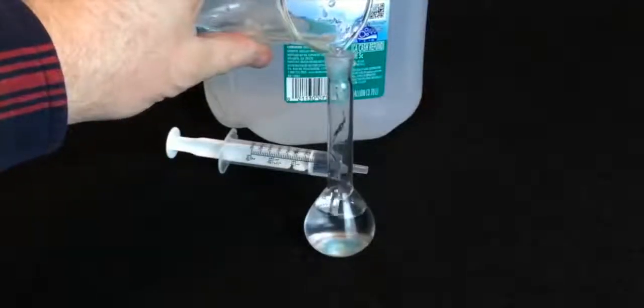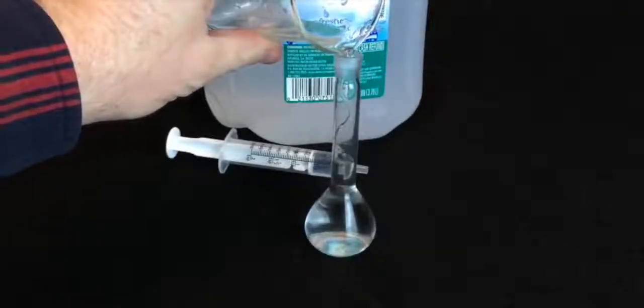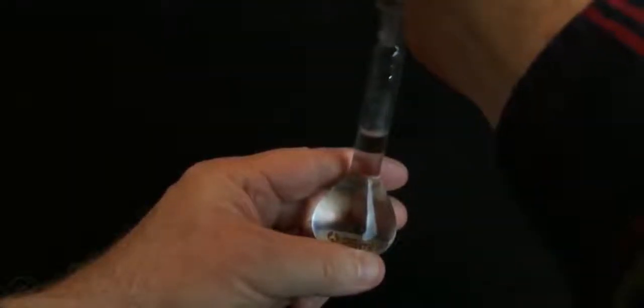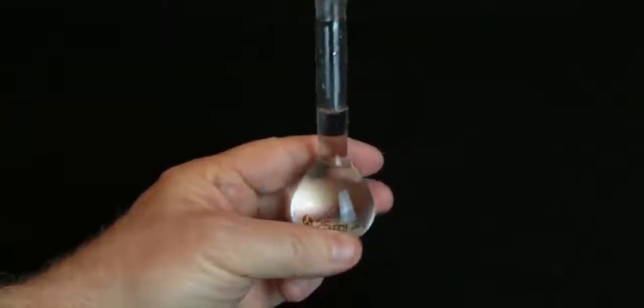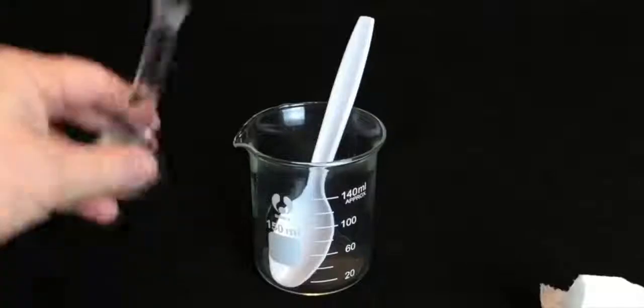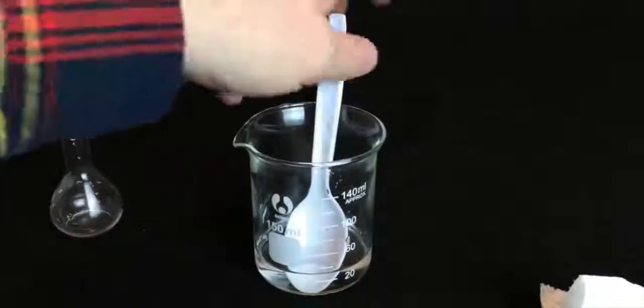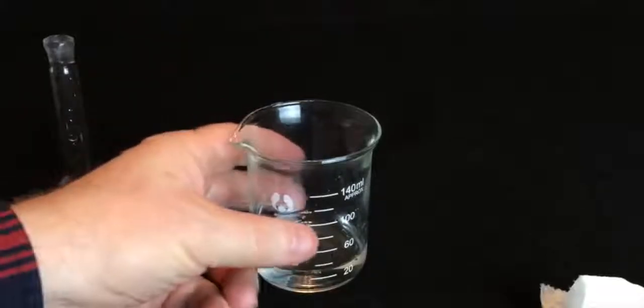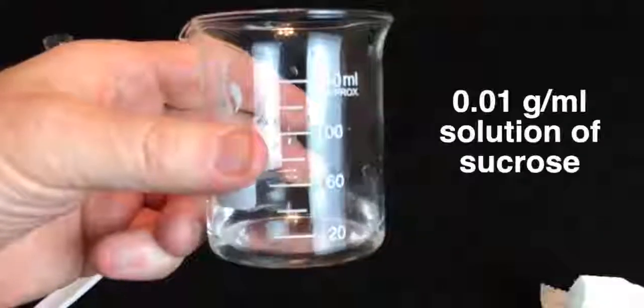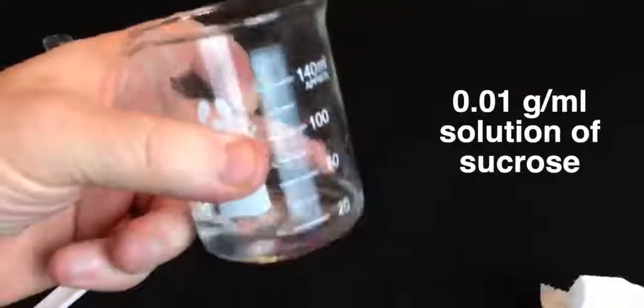Now to add the other nine parts, all you do is fill the flask with your solvent to the line. Note that you need to be very careful to approach the line slowly, one drop at a time, so as not to overshoot it, lest you dilute the solution too much. Next, just pour everything out into a beaker and mix it very thoroughly. And there you have it, your 0.01 grams per milliliter solution of sucrose.